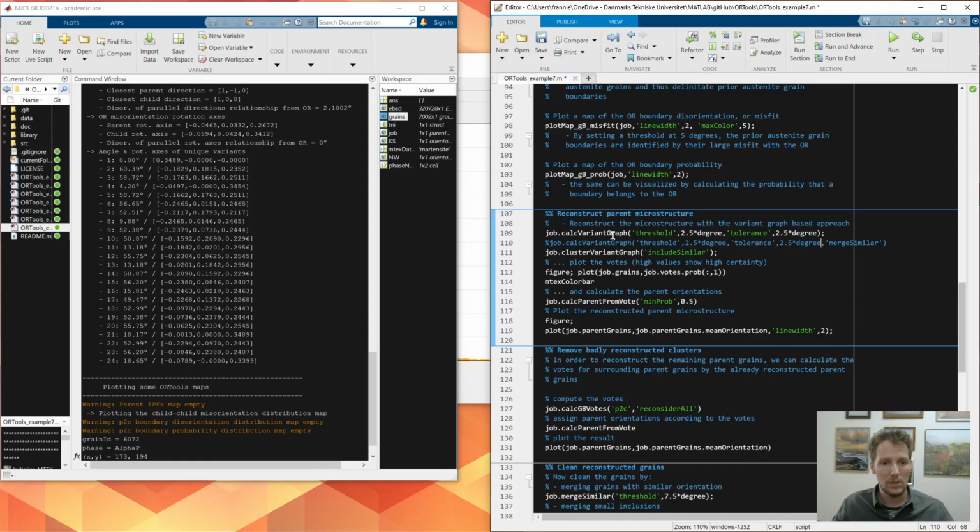And that's because it only looks at, okay, does this misorientation somehow match the orientation relationship? And it basically just advances node by node into the neighboring austenite grain. In some cases, if we're in an unlucky situation where two austenite grains are situated in a way that the misorientation matches the orientation relationship, this gives us problems with actually refining those prior austenite grain boundaries nicely.